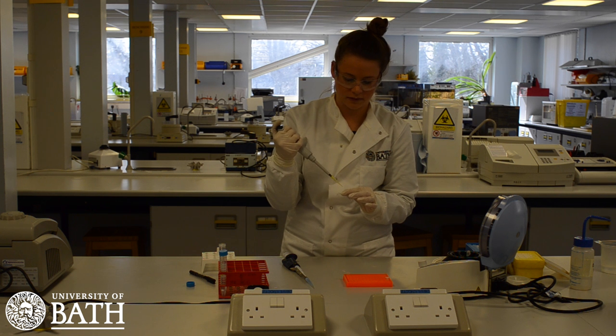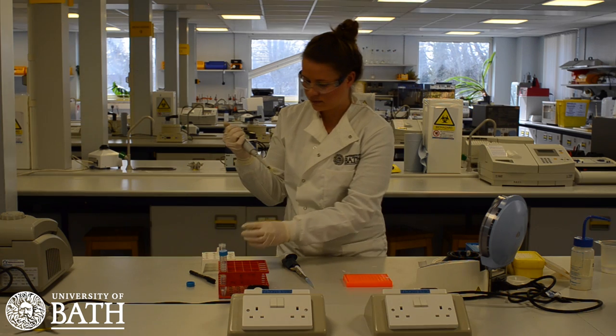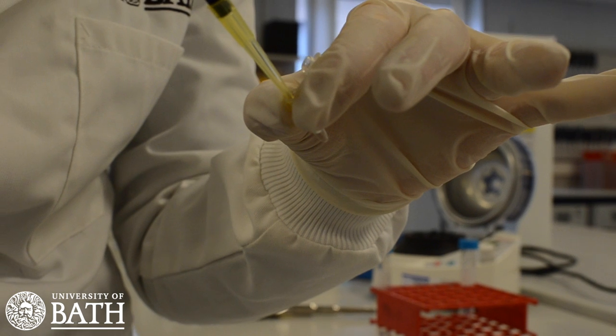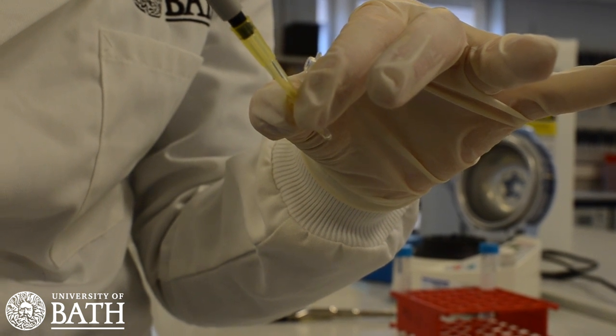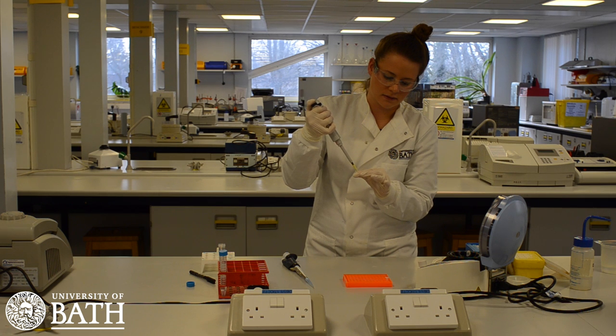Next, take 20 µL of your PCR master mix, which will be yellow in colour, and transfer this to the PCR tube that already contains your DNA template. Mix the two together by pipetting up and down in the tube a few times. Note that bubbles in the PCR tube, especially at the bottom, should be avoided.